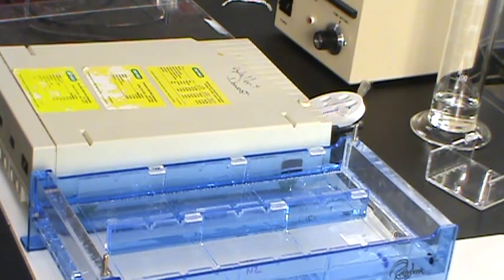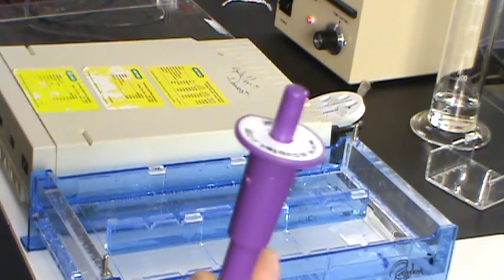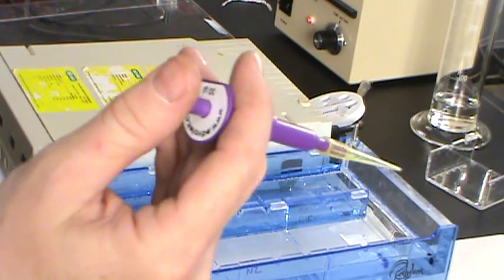Or have it float away. Now, in the interest of time, it could be that we have a lot of samples to apply and not enough pipetters. In that case, we have some single volume pipetters here that are available from Edvitech. They are these small purple ones like this. They're only 30 microliters, but that is still good enough volume. The yellow tips fit on them, as you see here.